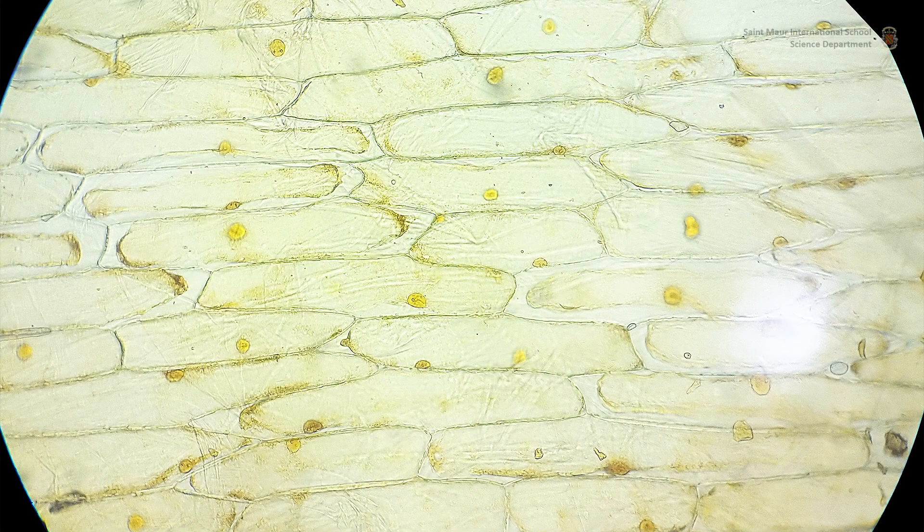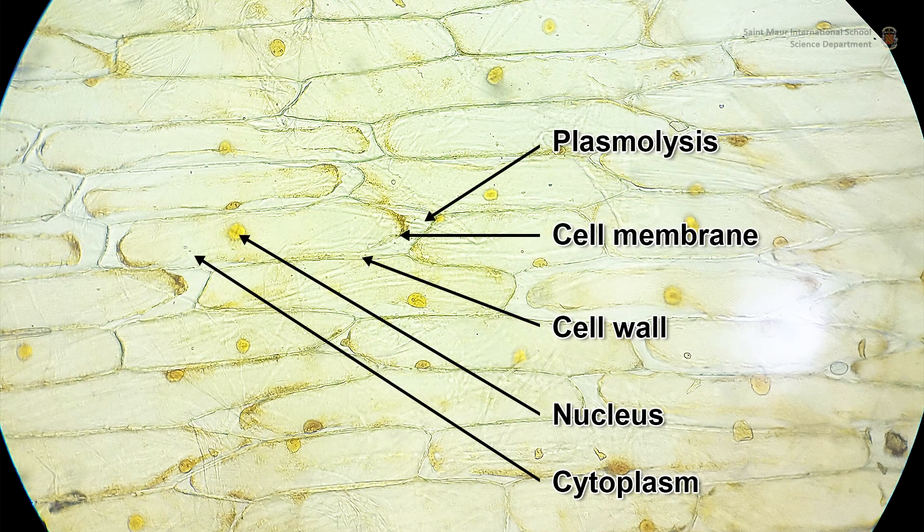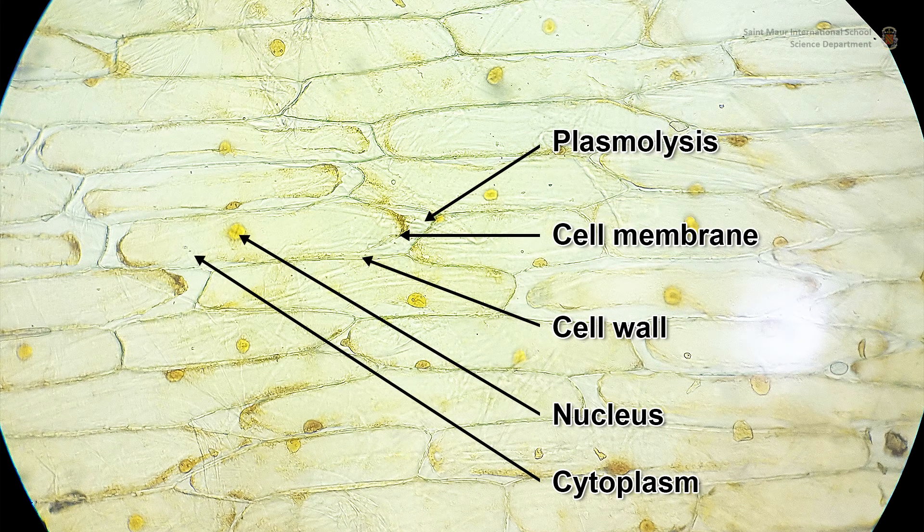This is a sample dipped into the sucrose solution. Note how some cells show plasmolysis, while others do not.